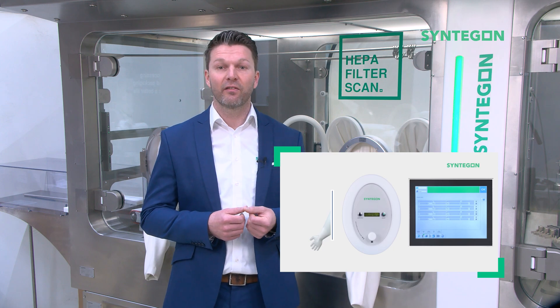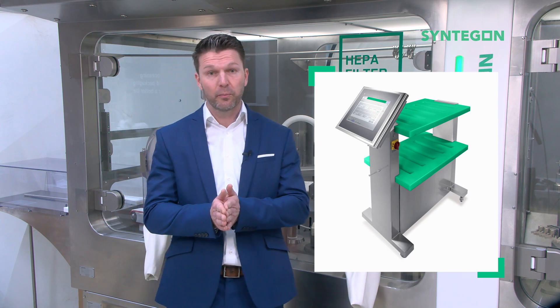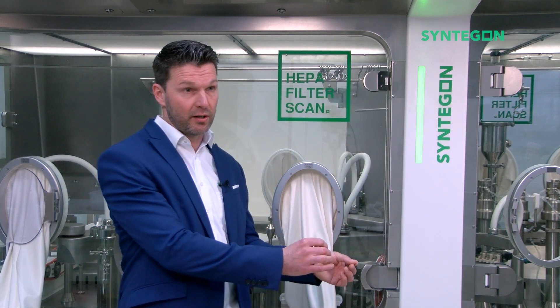Operation is done via HMIs of the filling line. You will get a dedicated test report for the individually tested gloves. It is also available as a stand-alone version for retrofit purposes or third-party equipment, with operation done via HMI built into the storage cart.